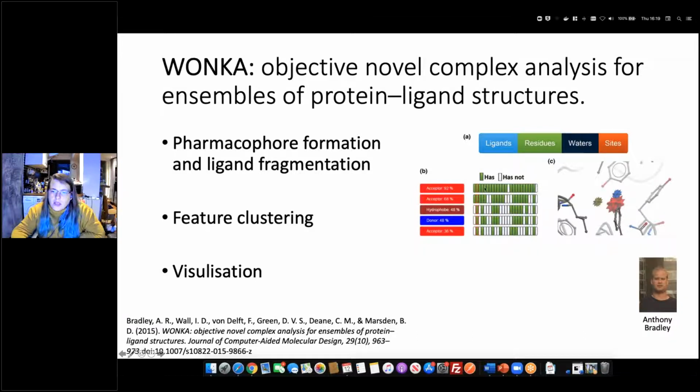And then across here, each one of these squares represents a ligand. If it's colored in green, it means it has an interaction with that pharmacophore, or it fulfills that pharmacophore. And if it's in white, it does not. So you can start to see at that point how we were thinking about looking at structures that come out of this experiment in a different way.